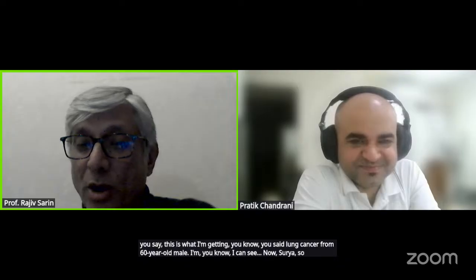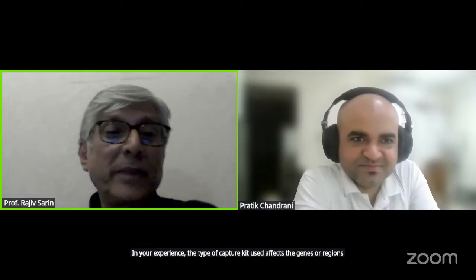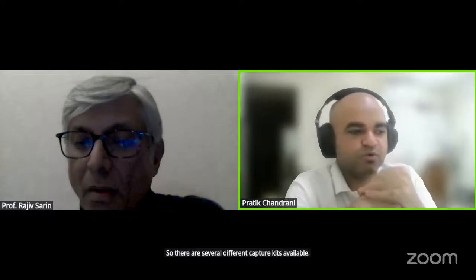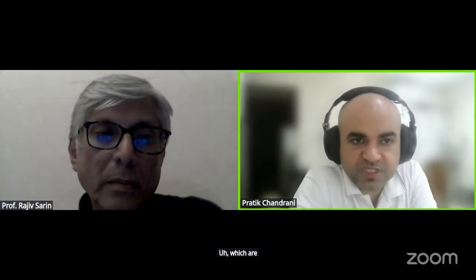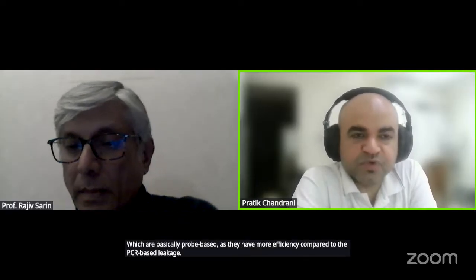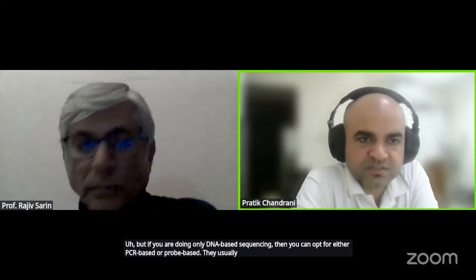Okay, so Anupriya Kaur says in exome, cancer exome data, in your experience, does the type of capture kit used affect the genes or regions coverage? So the capture kit, would you like to answer this? So there are several different capture kits available. For gene fusion, particularly, we use comprehensive gene panels, which are basically probe based, as they have more efficiency compared to the PCR based kits. But if you are doing only DNA based sequencing, then you can opt for either PCR based or probe based. They usually yield very similar results.